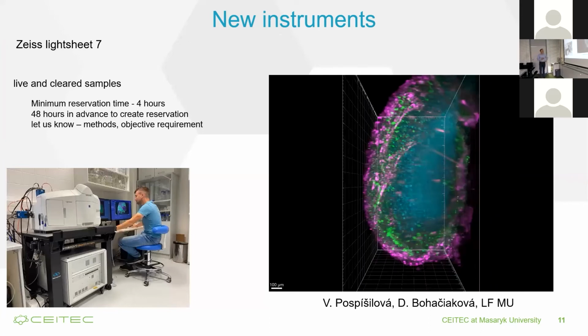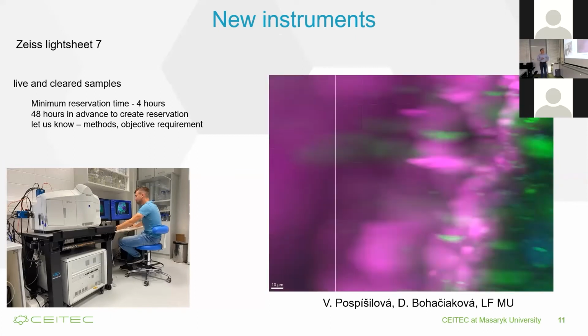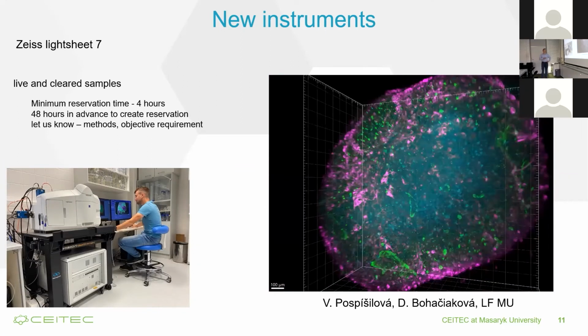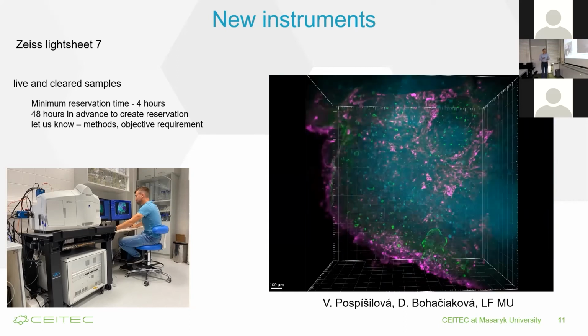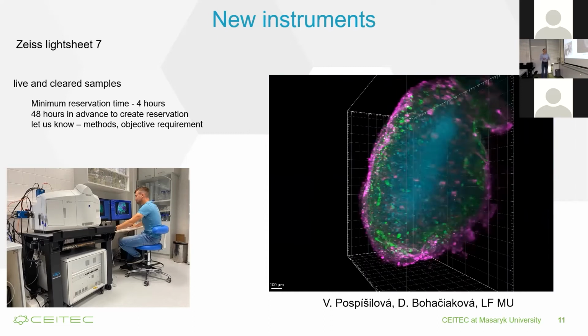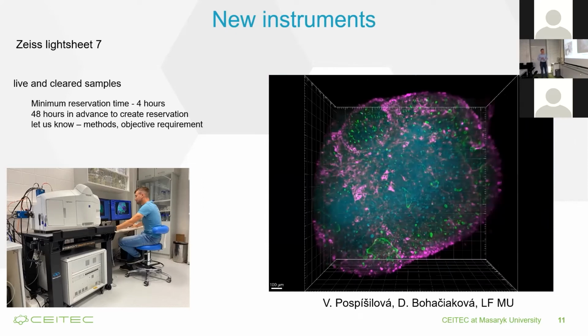Another big system is the light sheet microscope, and this is a completely different way of looking at the sample. There is big attention on sample preparation. It's not like the sample is on a standard cover slip and you put it on the microscope and look at it. You will spend a lot of time with sample preparation and sample mounting into the microscope. But this is a really great system, and we have all objectives and chambers, also for clearing solutions. People use it a lot for large objects, also for organoids and whole organisms, like a mouse embryo, and you can also image a whole plant system, roots, and so on.